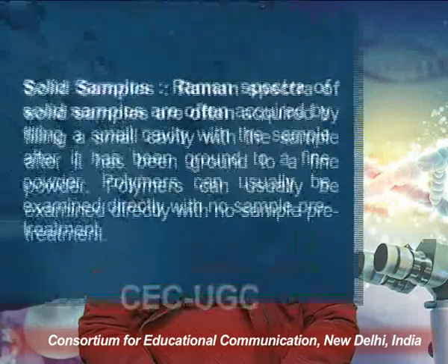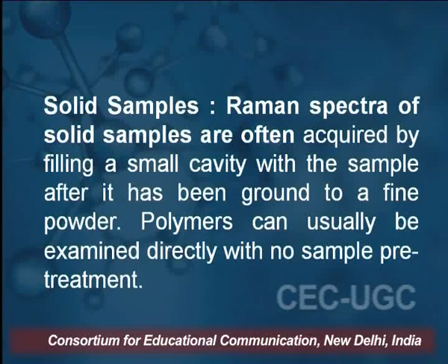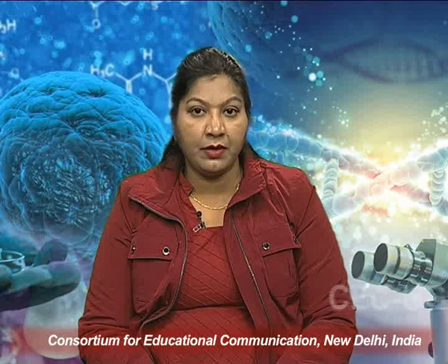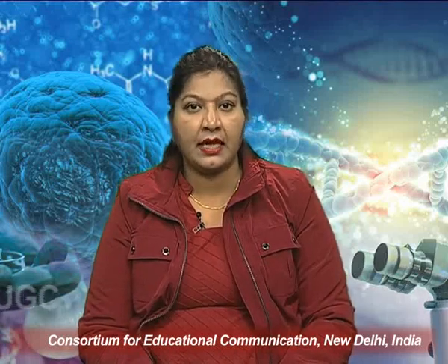Raman spectra of solid samples are often acquired by filling a small cavity with the sample after it is ground. It is just like a grain or a powder that can be used as a solid sample to characterize by Raman spectroscopy. Polymers can also be used directly; a polymer film can be put directly in the sample holder, and then we can characterize it. There is no special sample pre-processing in Raman spectra.